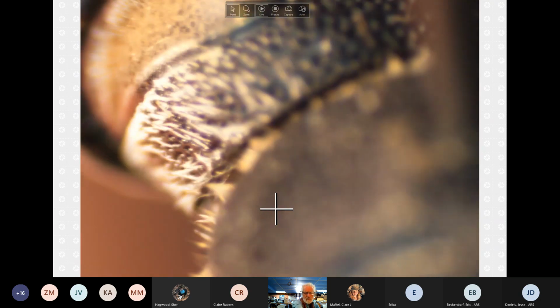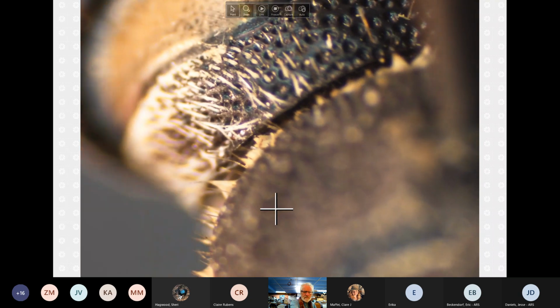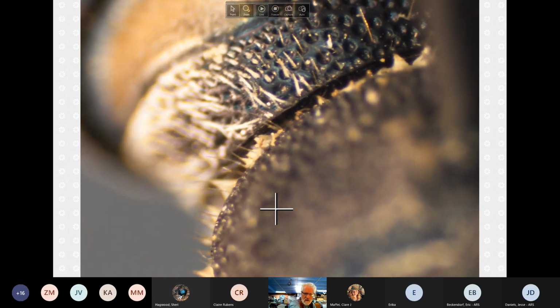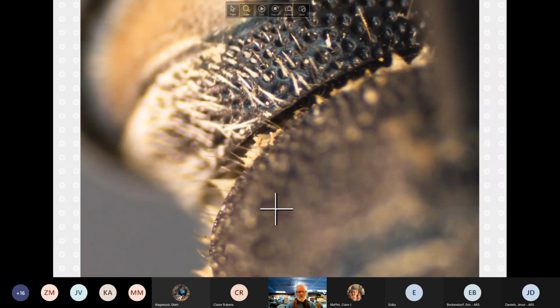Separate features, but different groups. Okay, so I actually don't see it at all here in this shot. Let's see what it says. Pronotal ridge produced but does not rise in height above the surrounding hairs. Okay, that makes sense. We can't see it.